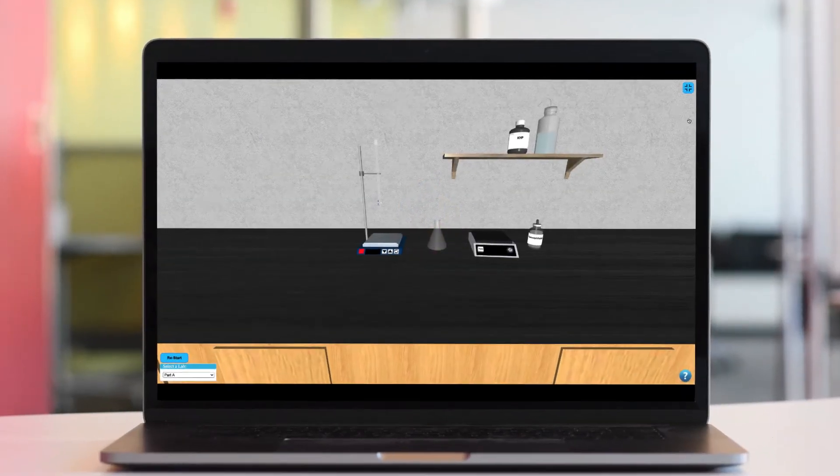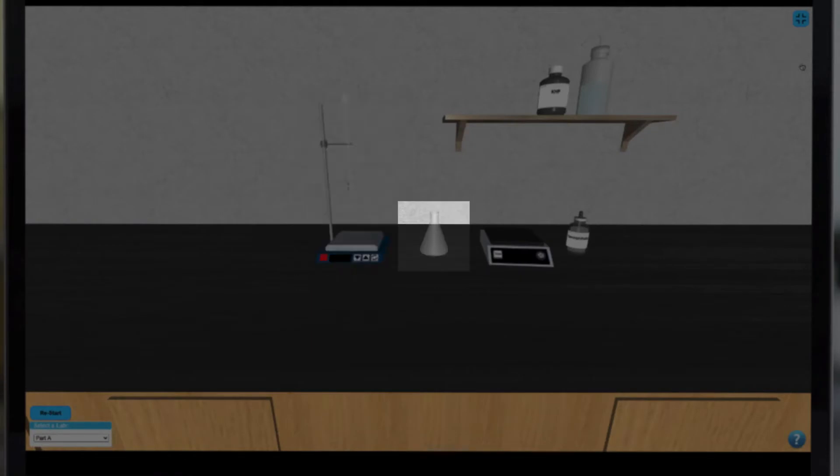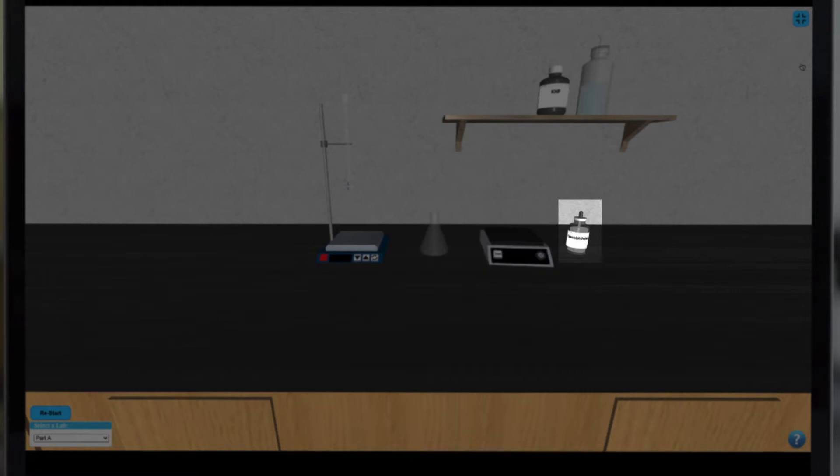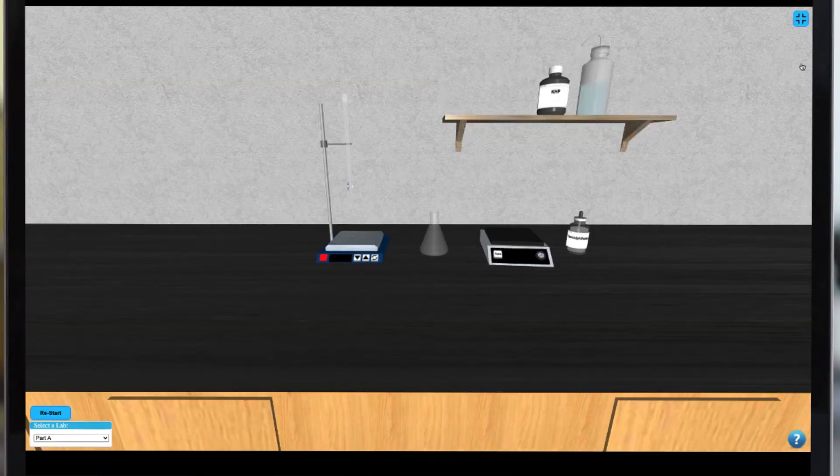In this simulation we have a burette over a stir plate, an Erlenmeyer flask, a balance, some indicator, and various samples on our shelf.